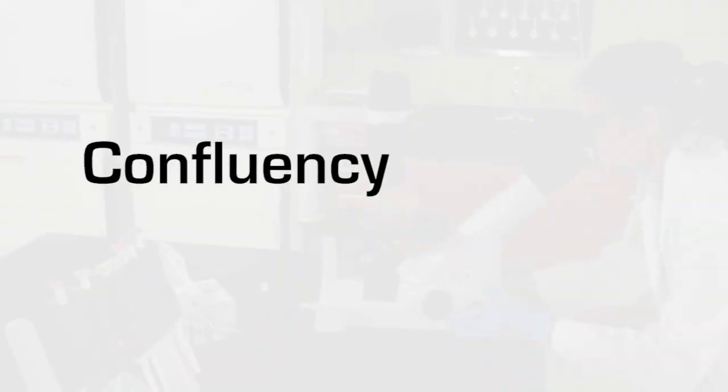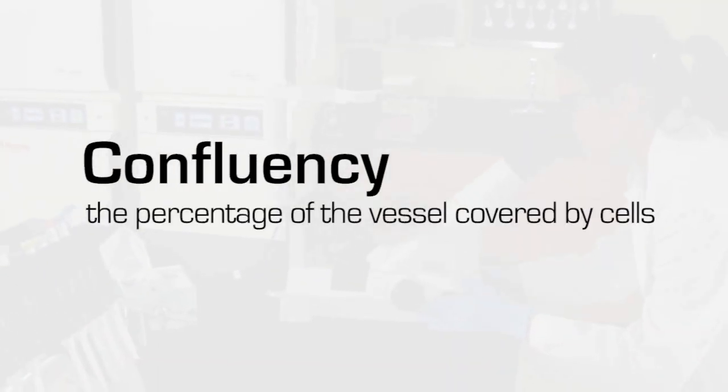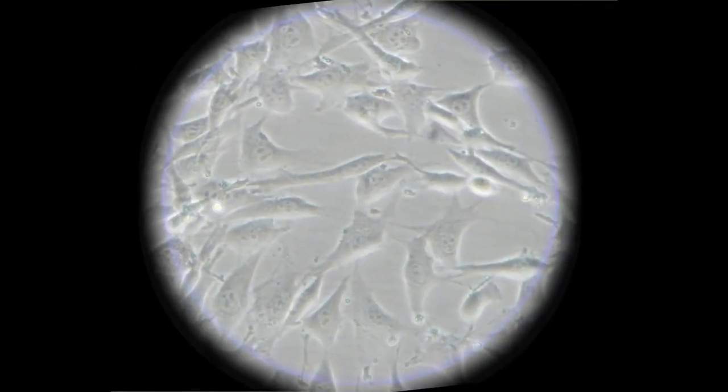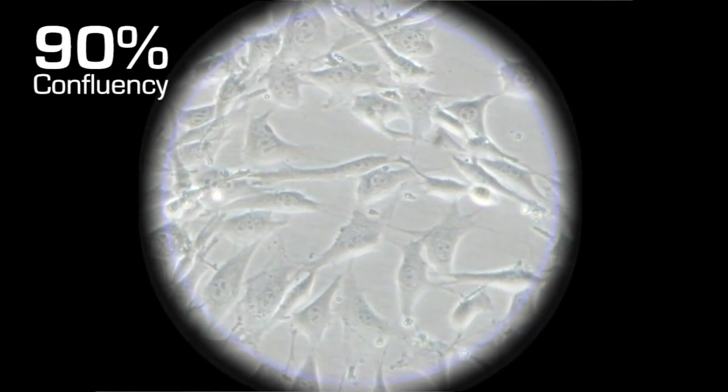Next, calculate the percent confluency. Confluency is the percentage of the vessel covered by cells. Our cells are at about 90% confluency.